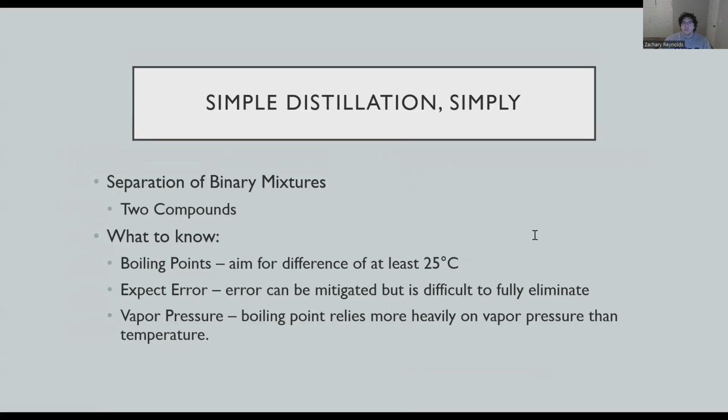We have simple distillation put simply. It's super practically used for chemistry students. People in general and organic chemistry labs use it. The easiest way to describe distillation, especially simple distillation, is the separation of binary mixtures. So you have two compounds, and you're trying to differentiate and separate them.